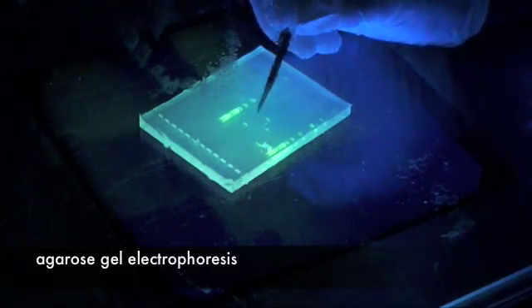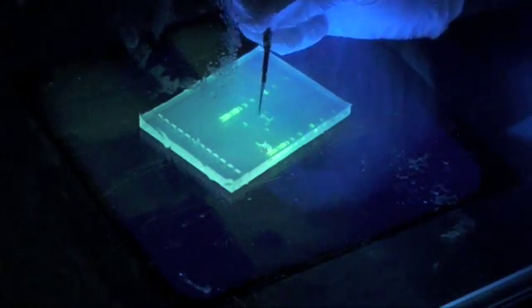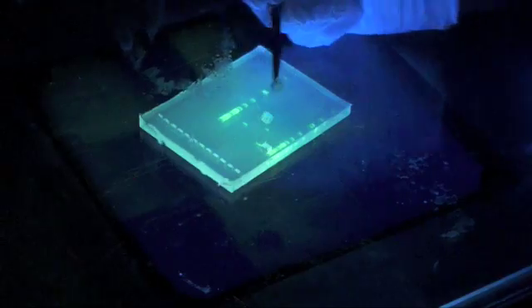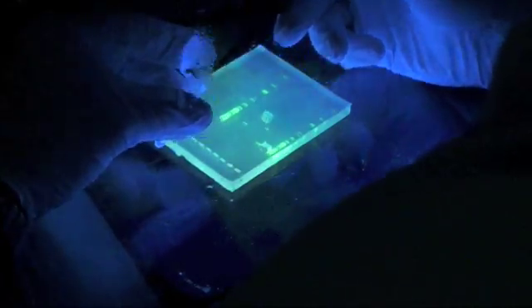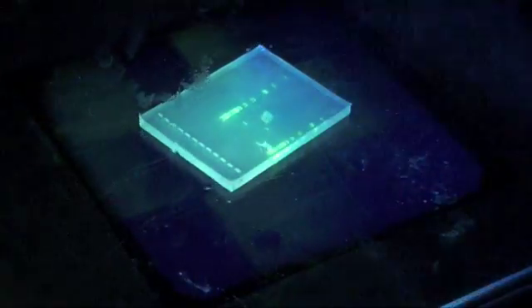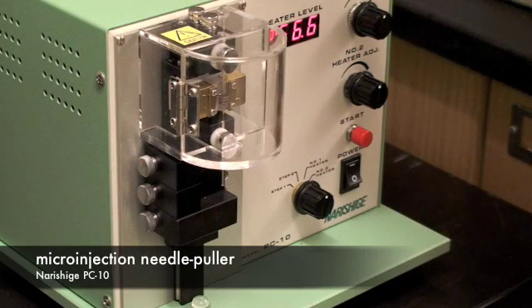Using this strategy, students in my introductory genetics course quickly generate many copies of their gene, purify the copies using agarose gel electrophoresis, clone this DNA into a bacterial plasmid, and finally label these genes using a green fluorescent protein taken from jellyfish or a red fluorescent protein taken from sea pansies.